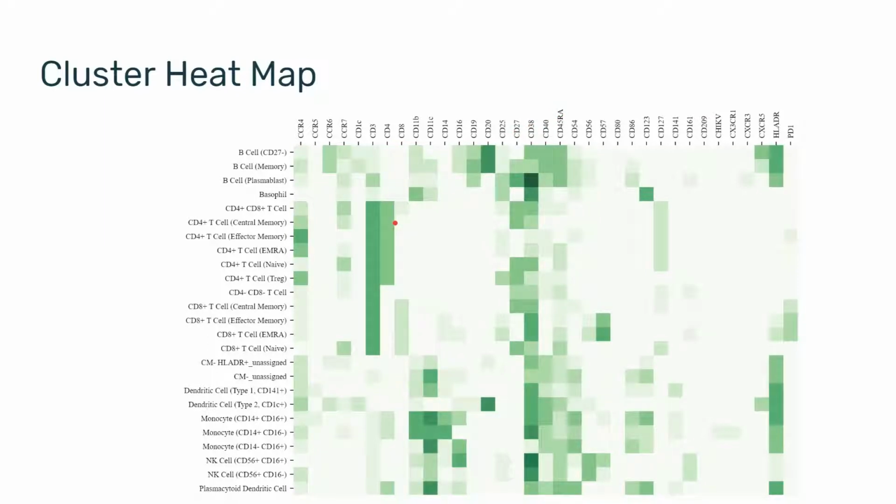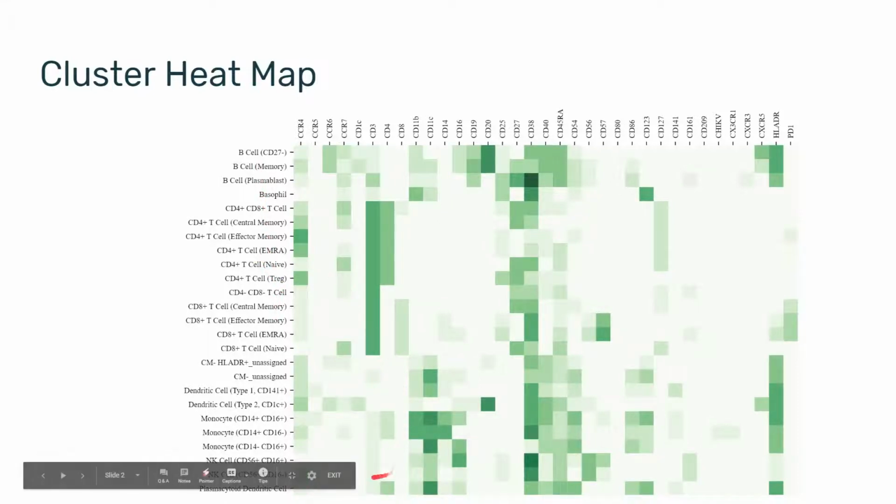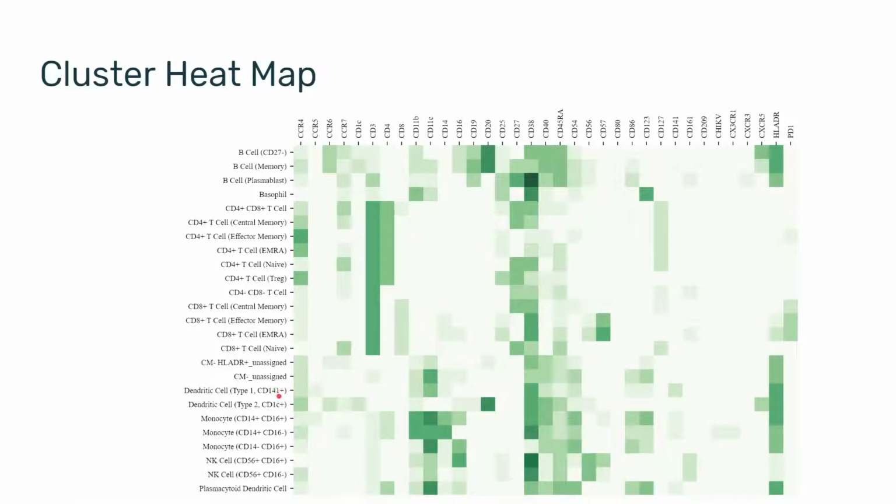The challenge, though, is that we don't really have a relationship between these different clusters. In this case, in fact, they're sorted alphabetically, which seems to work nicely, but not exactly. For example, the plasmacytoid dendritic cells are down here, while the actual dendritic cells are over here. So the question is, how can we add a mapping or a visual element to the clusters that we have?